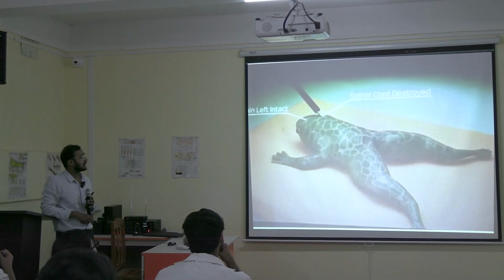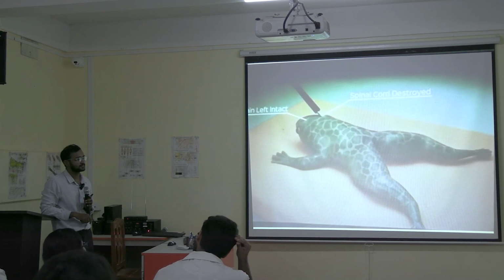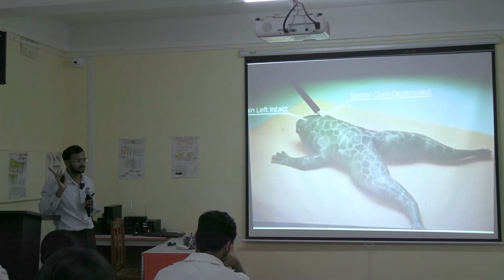Okay, so how will you prepare the experiment? In previous experiments we have seen that we used to pith the frog from the brain and then continue down to the spinal cord. Here, we are keeping the vagus nerve intact. The vagus nerve originates from the brain.